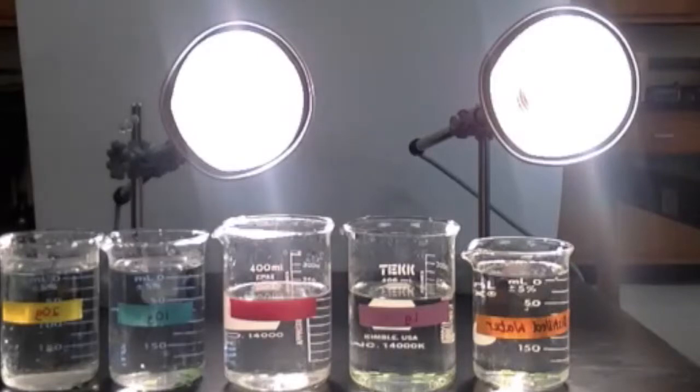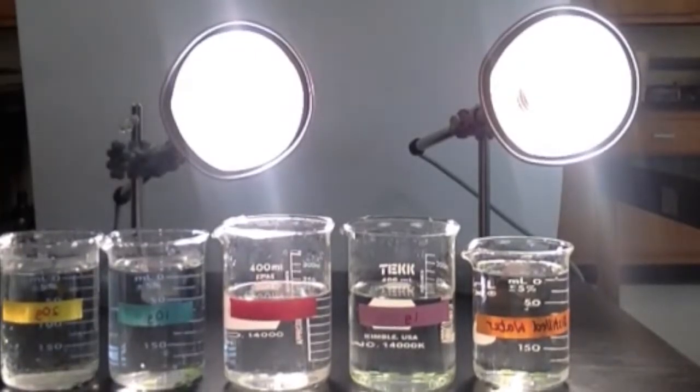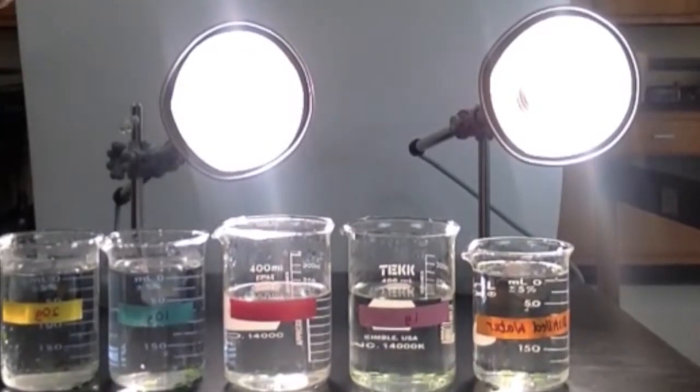At the 4-minute mark, the 1, 10, and 20 gram solutions each had 1 disc floating. At 6 minutes, the 1 gram solution had 6 discs floating and the 10 gram had 2. The 20 gram solution still has only 1 disc floating, and both the control and 5 gram solutions have none. At the 8-minute mark, the 5 gram solution finally has a floating disc. The 1 gram solution adds another disc, making it a total of 6 leaves, while all the other groups remain constant.